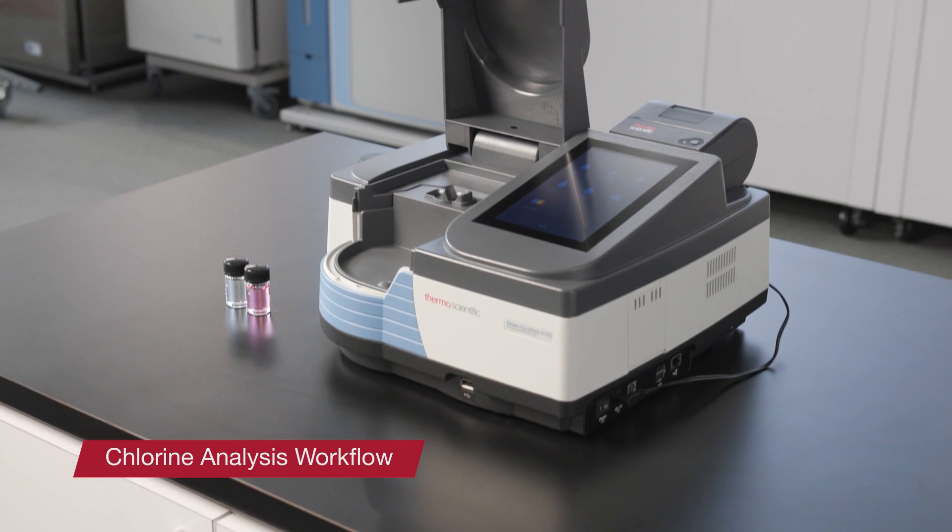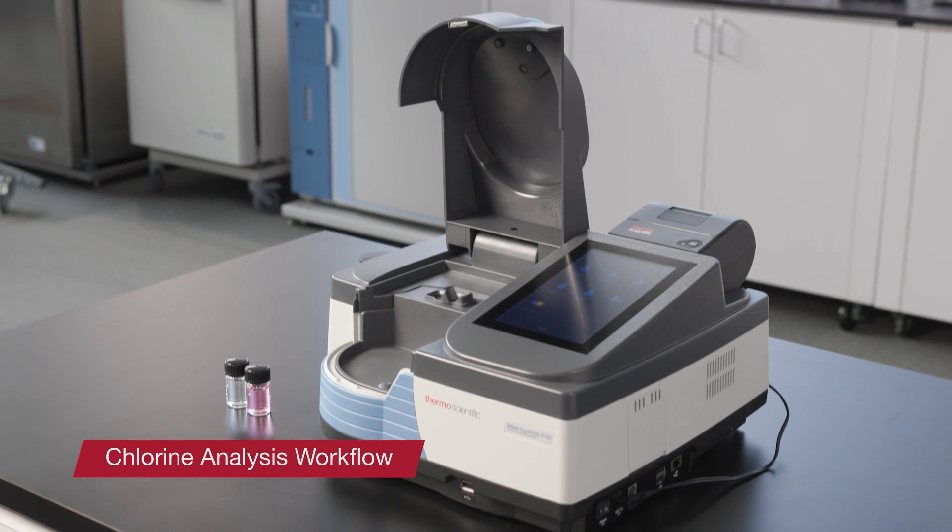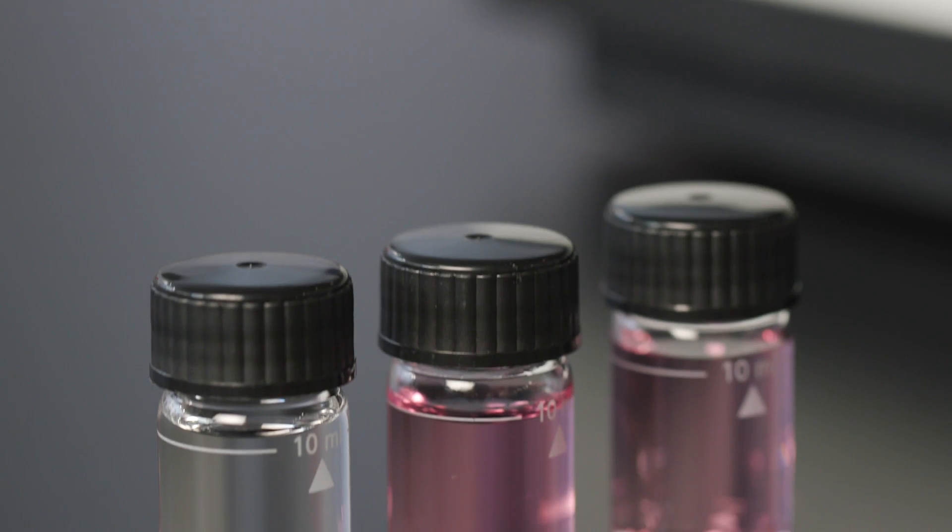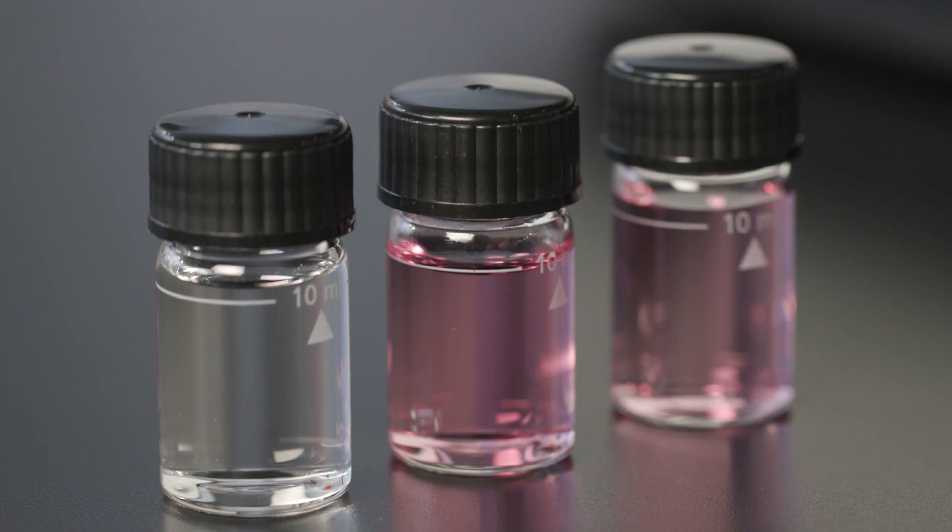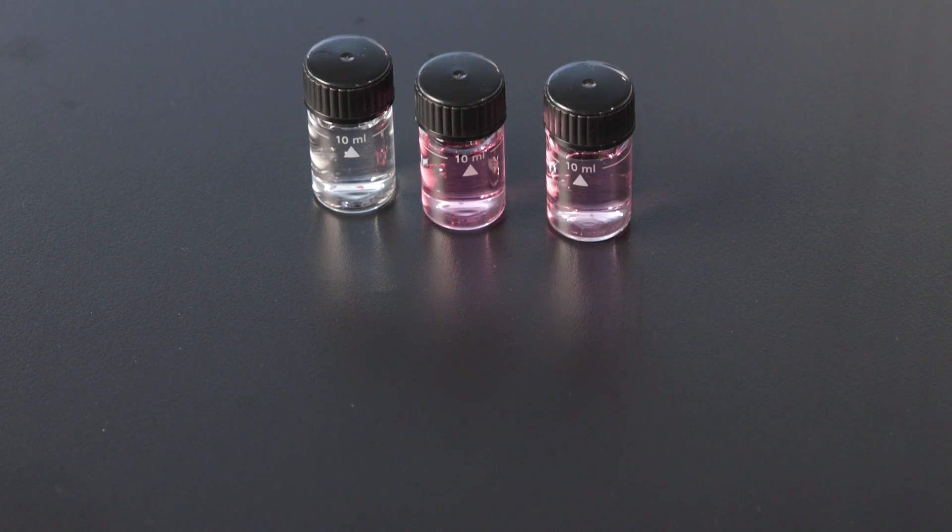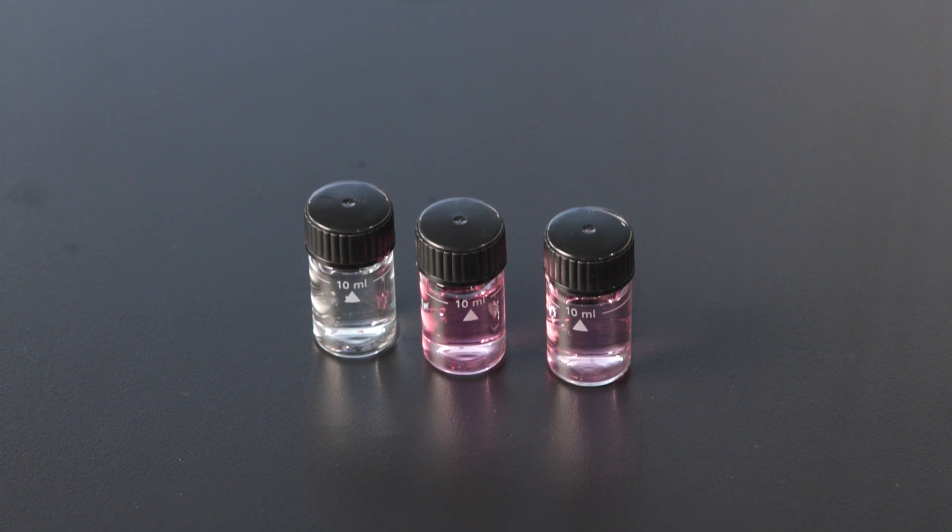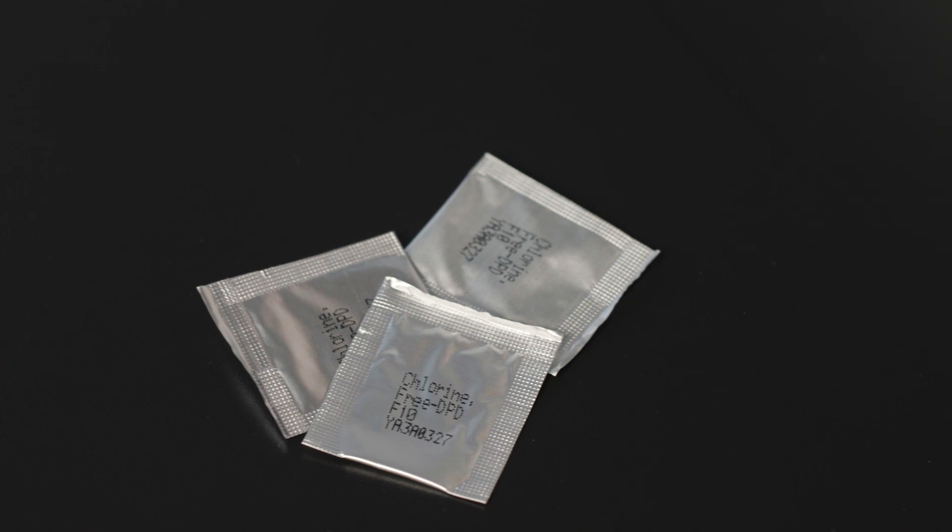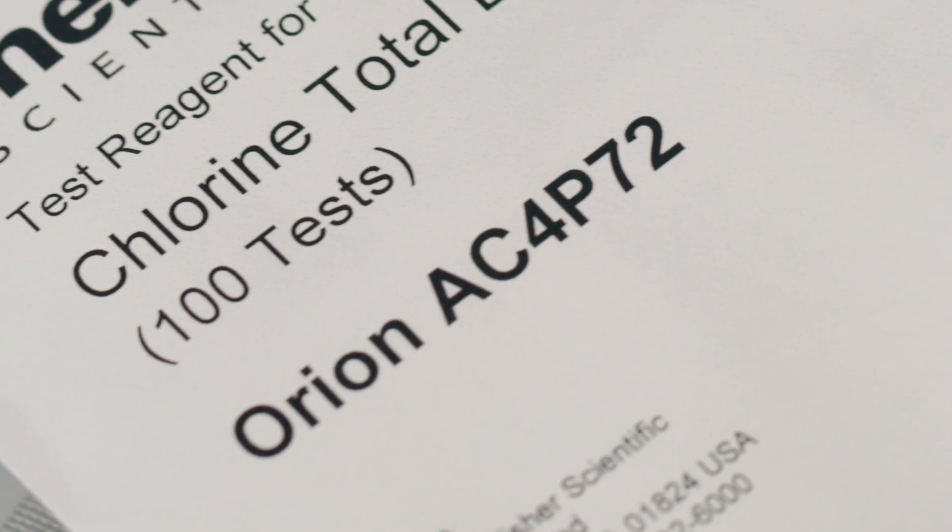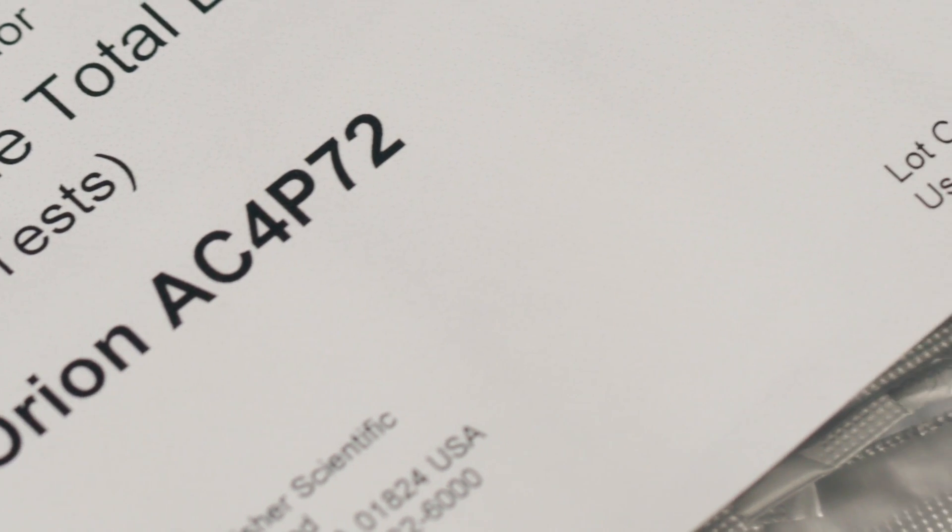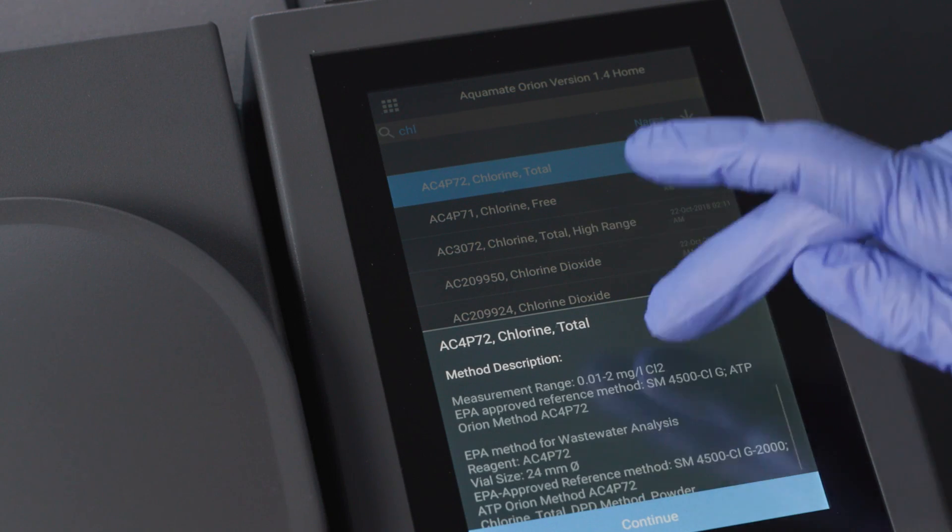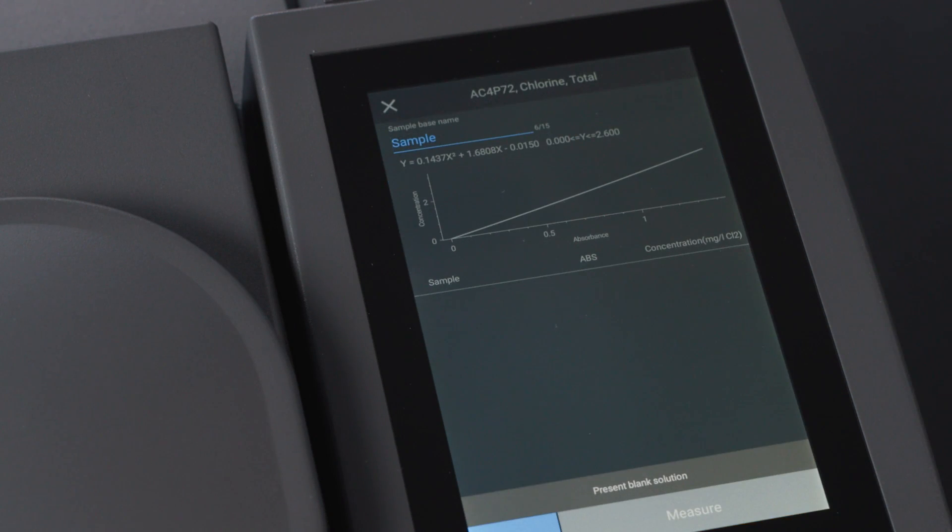Next, I'd like to run a quick total chlorine analysis as a workflow demonstration. A couple of minutes ago, I prepared these samples to analyze using the Aquamate spectrophotometer. These were prepared using Thermo Scientific Orion Aquafast total chlorine reagent powder packs. The part number is shown here on the package and correlates to the method on the Aquamate AC4P72. The reagent can be conveniently ordered using this same catalog number.